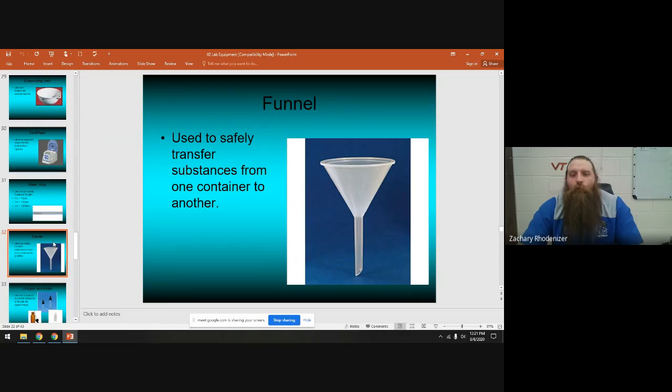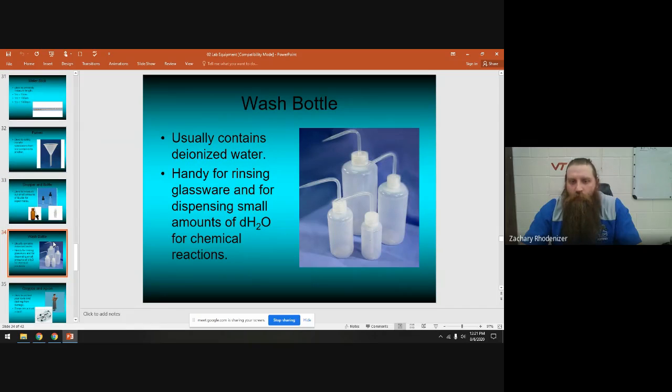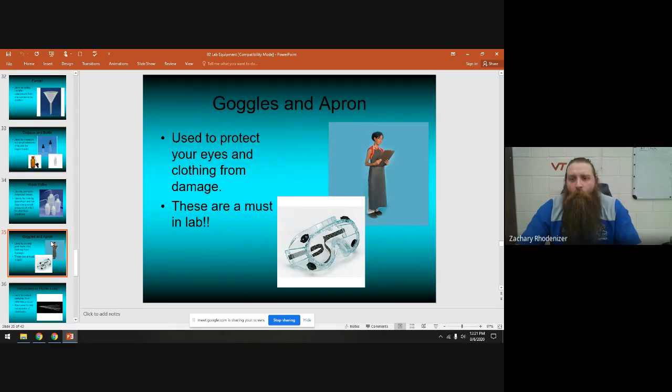Funnels are used to transfer things from one container into a narrower one. I usually use plastic funnels for solids because they have a slightly larger opening, and glass funnels for liquids. Droppers and dropper bottles are used to put out one drop at a time for small experiments. The wash bottle, which we'll use a lot, contains deionized water (dH₂O) — water with nothing in it — great for rinsing things out without contaminating your experiment.